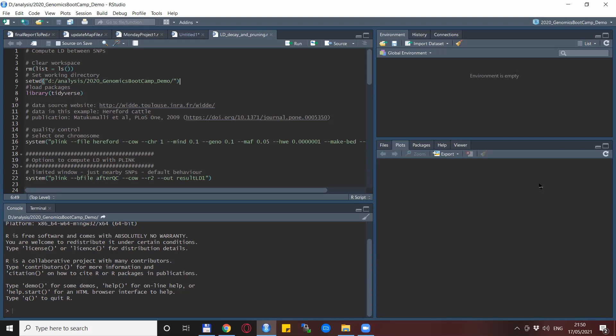It consists of three parts: the first one showing some of the options and possibilities for computing LD in Plink, the second part shows the computation and visualization of the so-called LD decay, and the third one is showing the procedure called LD pruning.